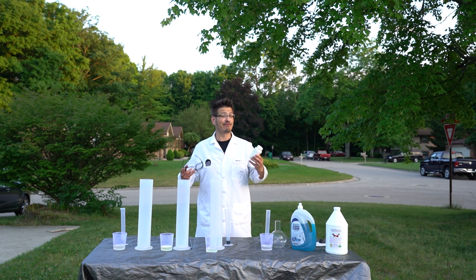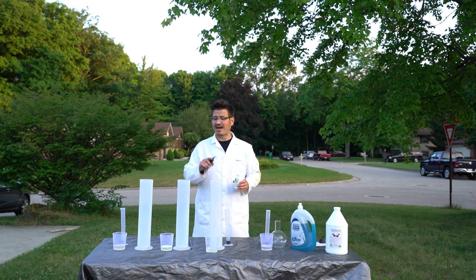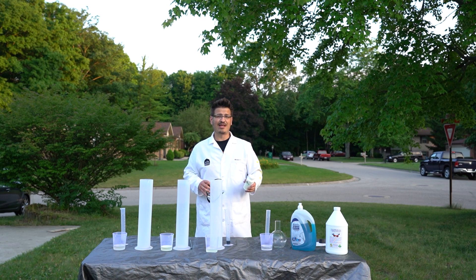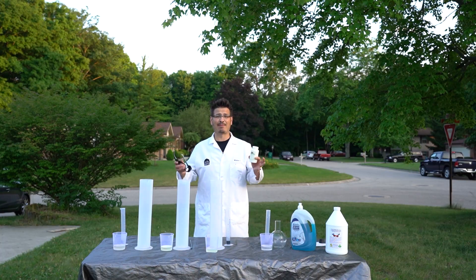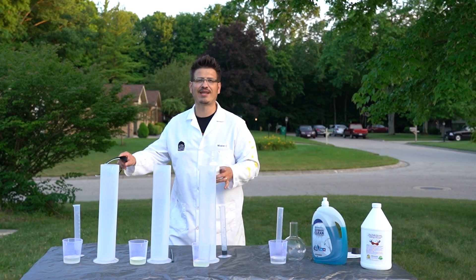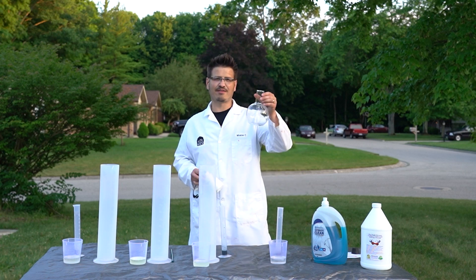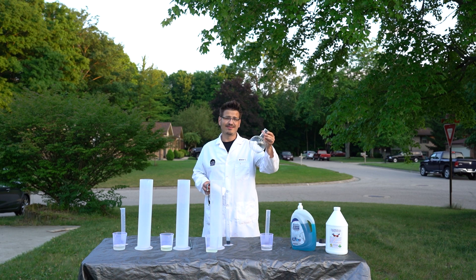Potassium iodide acts just like the yeast that you use at home for the fun family-friendly version. So what we're going to do is put 200 milliliters of 35% hydrogen peroxide into each of these graduated cylinders, add a little bit of soap, then introduce our potassium iodide to see what happens. But before I do that with these three graduated cylinders, I actually want to test with this flat-bottom flask first — I've never done elephant toothpaste in this shape of container, so tonight's the night to try something new.